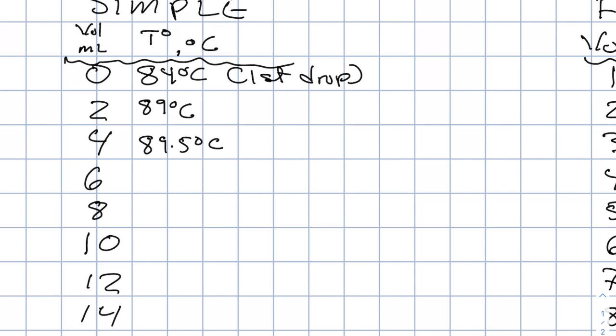Every two milliliters, we will record the temperature. You can see the temperature rises rather quickly and then forms a steady rise. About half a degree seems like each two mLs, roughly speaking.